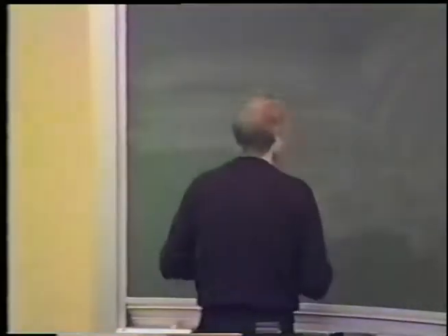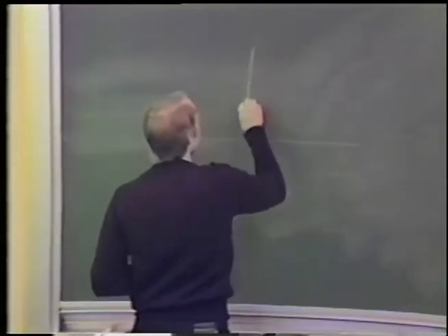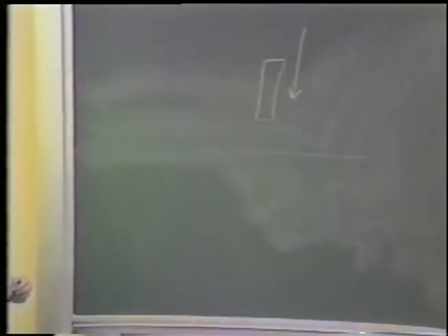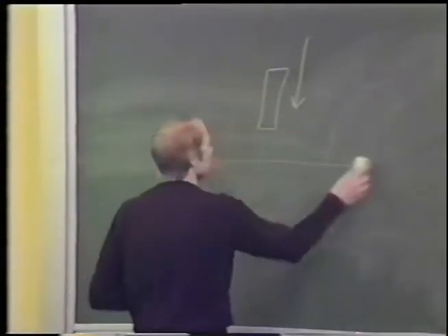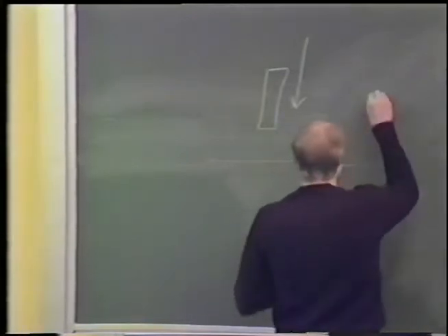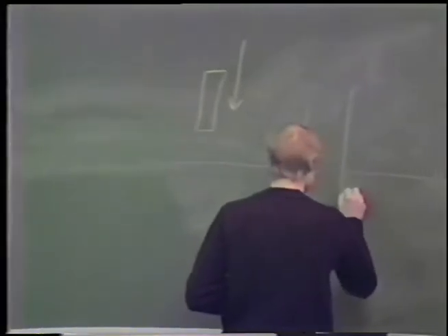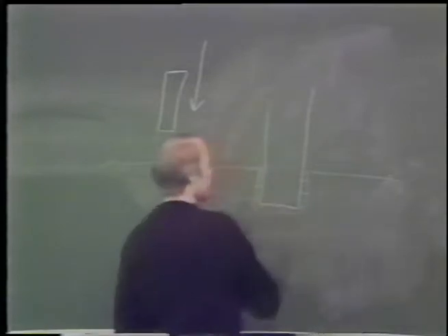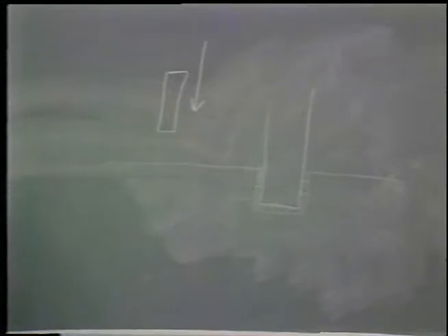What happens, here you have the surface of the cryogen. Here's your warm sample coming in. When the sample approaches the cryogen, or the cryogen approaches the sample, depending on how you're doing it, before contact can be made between the sample and the cryogen, radiative transfer of heat, here's IR radiation, will vaporize the cryogen around the sample.